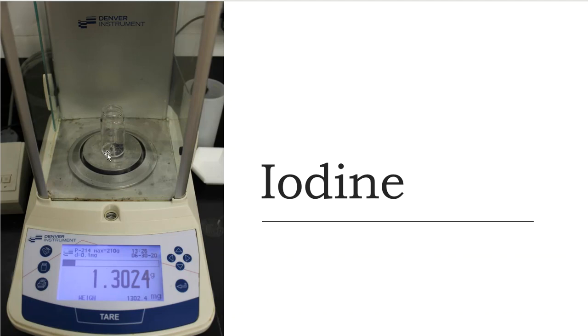So I've tared the vial, and then I've added some iodine crystal into that container. Keep in mind how much we need to weigh out. 1.3024 is the final amount that I've used. I know it might be a little bit over our expected amount, but folks, I've always told you all along, this stuff is ballpark figure. So do not go crazy trying to get the exact amount of things you need to weigh out for these synthesis reactions. If I was making solutions for real and being analytical in nature, yes, I would try to get as close as I could. But these are organic reactions. We're just making a product. That's it. So ballpark figures are going to be okay.